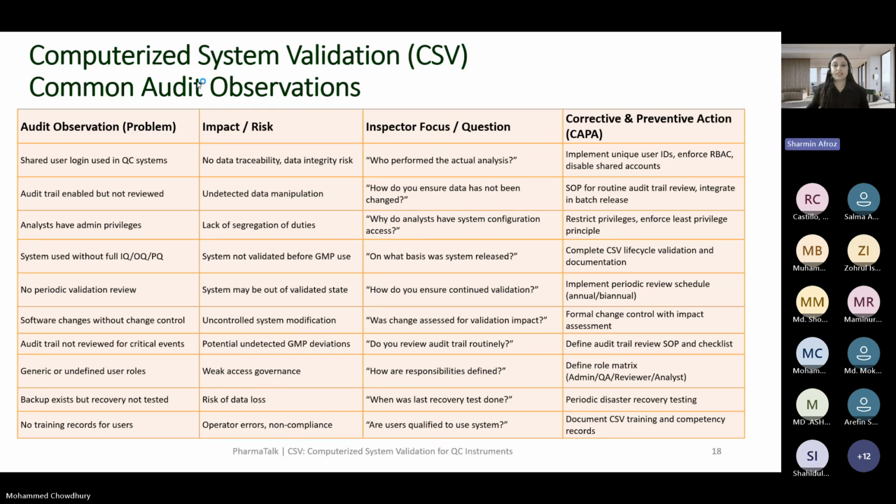Not like that. In the data integrity documents from FDA, there was a question-based guideline. There was a question: when should we review the audit trail? During the batch review. And who should perform it, whether the hard copy or the electronic copy, the person who checks the batch record will perform the audit trail review. This is for the routine analytical activity.